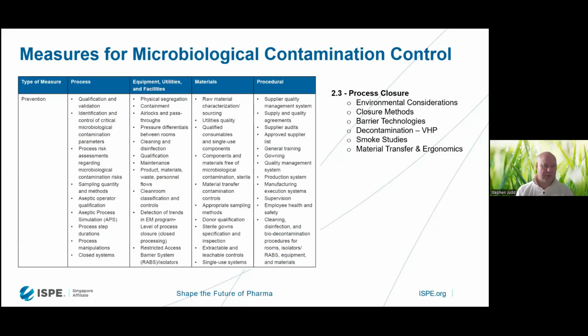So this is not desirable from a sustainability perspective, it's not desirable from an operability perspective, and it's not desirable from a cost perspective. Therefore, there's been a lot of work in process technology development to allow this to become more efficient. As the industry has progressed and we have moved towards more automated and closed systems, this has allowed the clean room backgrounds to be reduced. And one of the good discussions in the guide is around isolators versus BSCs.